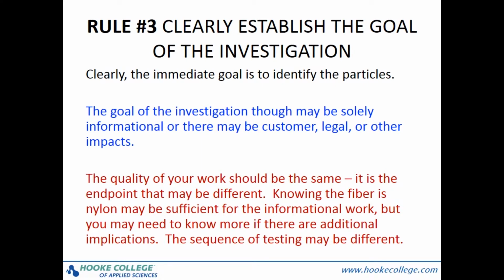I once was asked to verify that a small plastic piece was a bristle from a brush used on the line. I did, mainly using IR microscopy, but I did not take many pains with the report. In fact, it was just an informal email note, just like the request to me was an informal email note. Everything was informal, all was fine. A year later, I'm asked to provide the full report since the requester had submitted the information to the FDA.